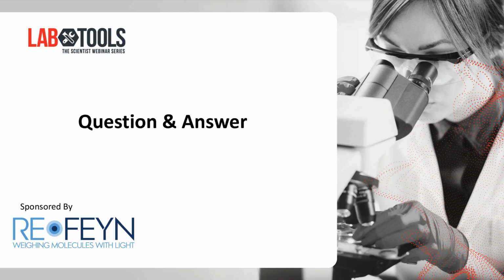Sure, thank you. Could you explain to us how mass photometry actually works? Do particles of the same size hit the glass at identical times, and is time a factor to measure the mass? Yeah. So for the interest of time, I didn't describe it that much. Short answer is no. That's not it. In essence, you load samples onto a glass slide, and just through regular Brownian motion, the particles will eventually hit the surface of the slide. So it's not the time that it hits the glass that lets us measure the mass. It's actually the scattering intensity of each particle.